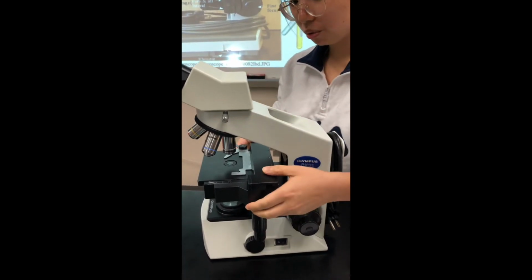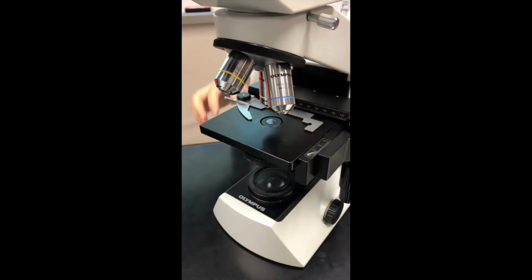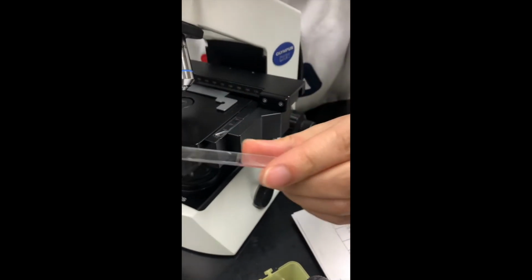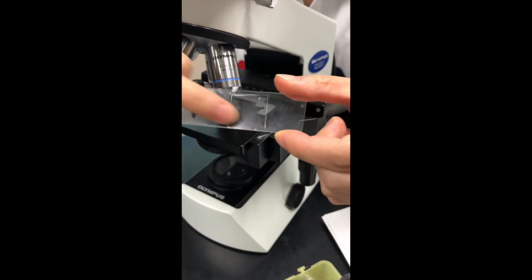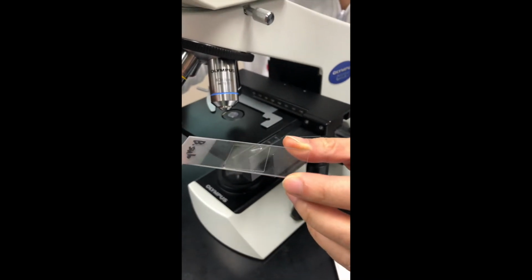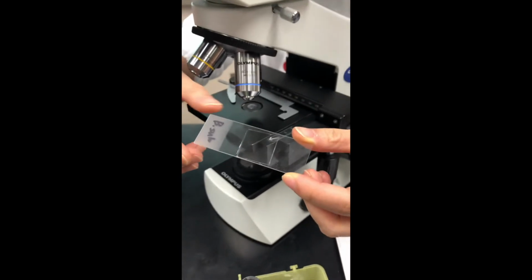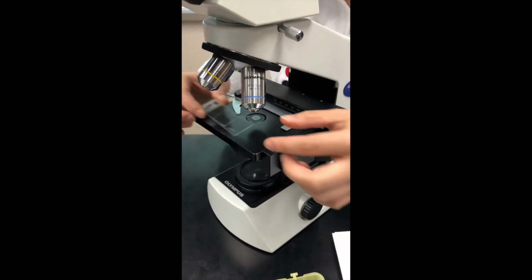Let's go to the stage part. Here we have the stage where you could have the slide placed. Every time when you place a slide, you touch it. Here is our top side. Sometimes it's confusing which side would be the top side and which side would be the bottom side. But when you touch here, you could notice. So the cover slip is on the top side.